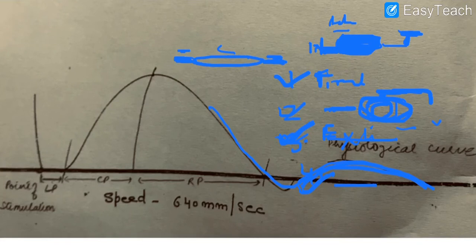And the fourth one was the elastic component, the series elastic component. Stretching of those will also involve some time. And the fifth one is the inertia of the stationary lever. So, these are the five reasons for this latent period, right?